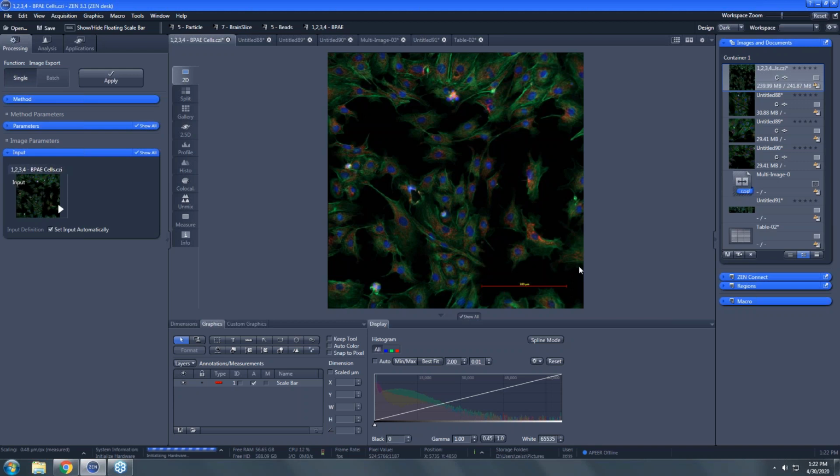All right, so we've done some manual measurements. Let's do some other types of measurements. I got a couple more that I want to go through. Something that I get asked fairly often is, how do we measure the size of something in fluorescence? In particular, this is usually a boundary or a small object, because it's not obvious where the edge of an object is when we image in fluorescence. So to demonstrate that, we're going to close all of these images and open up a set of beads.